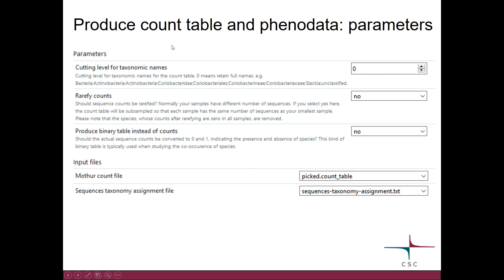This is what the parameter panel looks like — here you have the rarefaction parameter. One thing to note is that for those species where the counts after rarefying would be zero, they are actually removed. So you are losing information if you set this parameter to yes.